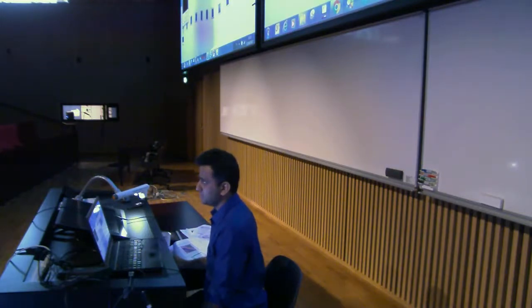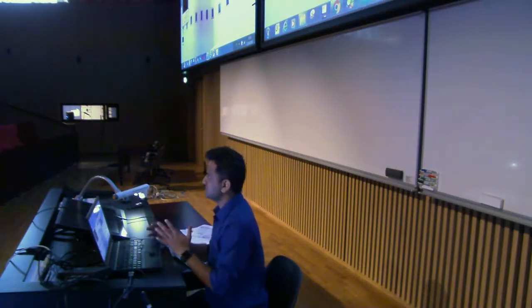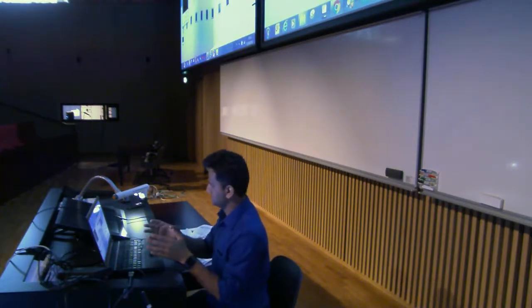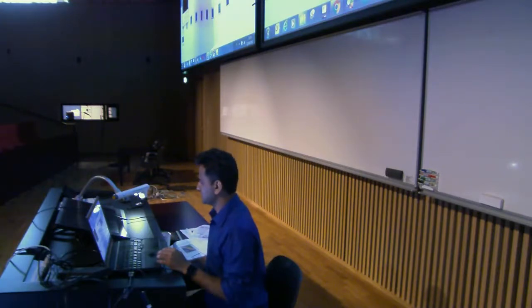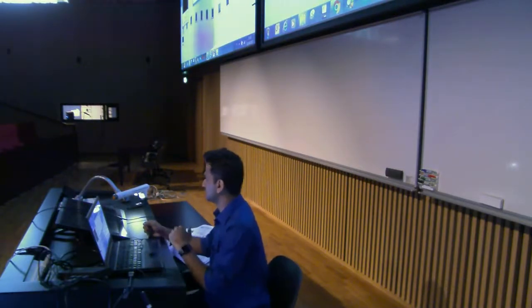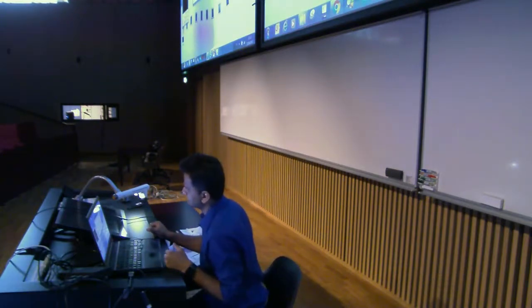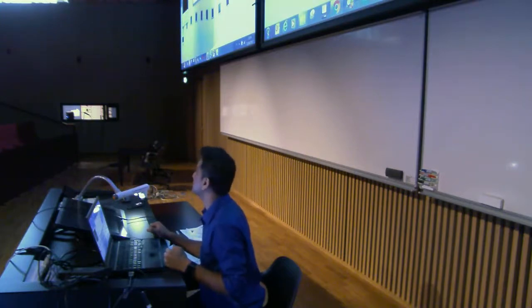So what we have done so far is just importing one image, doing some processing, doing some segmentation, but this is just for one image. One can write a macro on this. So one can just go to plugin, go here, macro, and one can record it actually. So whatever you do here will be recorded here, and you can save that as a macro, and then you can apply that macro to a whole list of images, like batch processing. That's possible, and we will cover this in the next class or next workshop. Okay.